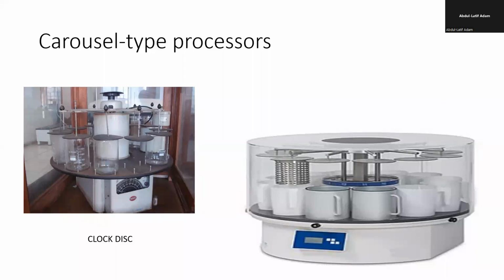It runs until there is a power cut, and you can set the delay timing, so that it should start on Sunday by 10 p.m., and then it will start the processing on Sunday 10 p.m. If you want it to be processed by Sunday, you can say Saturday 4 a.m. or Saturday this time.